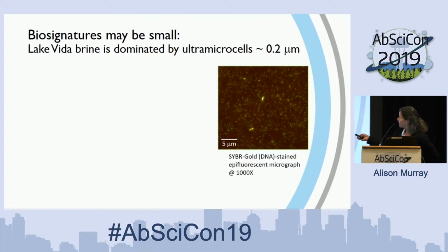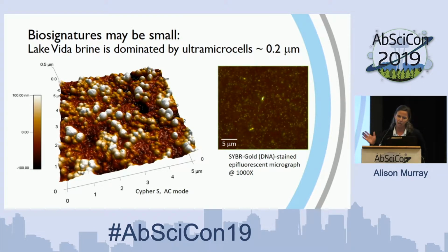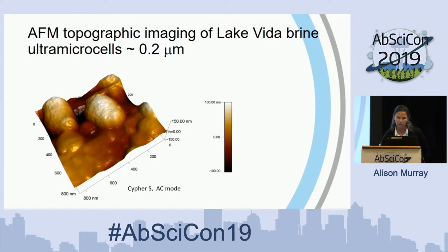And this background, the sort of starry night, barely shows up. What we really have is one of the brightest DNA stains under an epifluorescent microscope. If we look using an AFM, you can see really what these particles look like. You can zoom in at higher resolution and start looking at the surface textures of the cells.